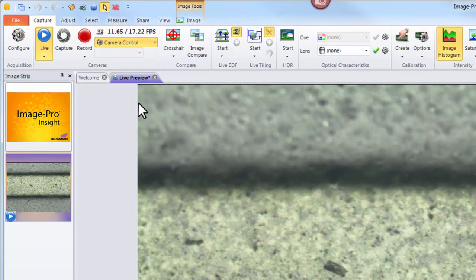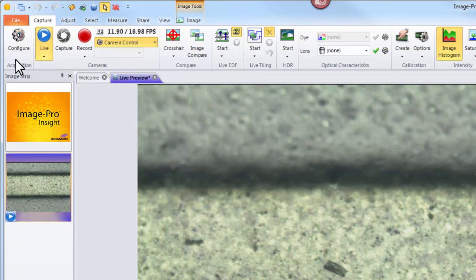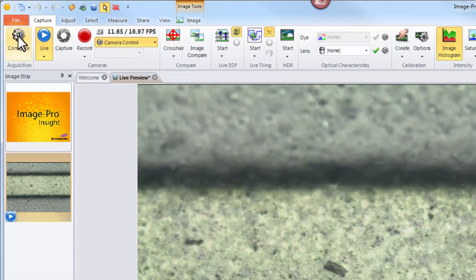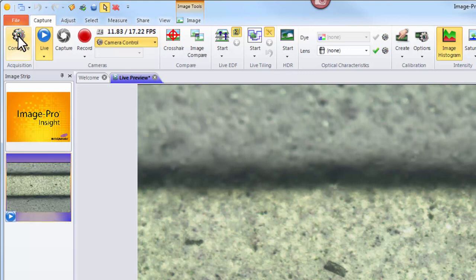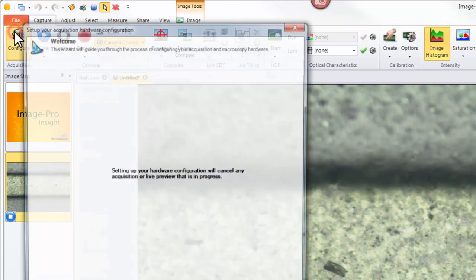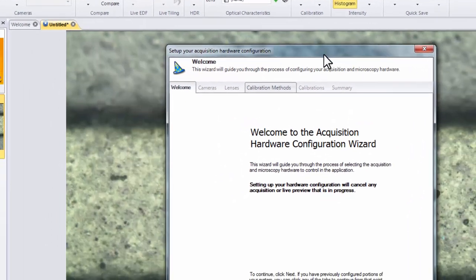The best way to set up our lenses and our calibrations for the first time is by using the configuration wizard. This can be located on the capture tab and is denoted by a gear icon. Let's first turn off our live preview and open the configuration wizard.